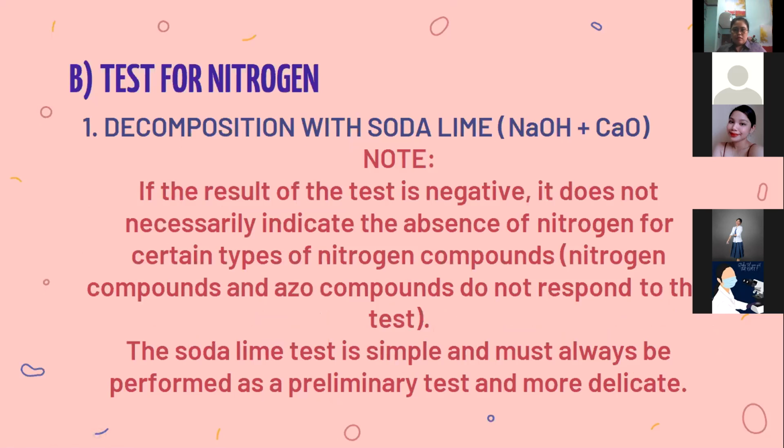Decomposition with soda lime. Note, if the result of the test is negative, it does not necessarily indicate the absence of nitrogen for certain types of nitrogen compounds. Nitro compounds and azo compounds do not respond to this test. The soda lime test is simple and must always be performed as a preliminary test.